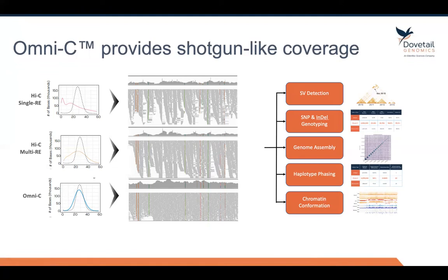What I'm showing here is sequence coverage plots. The x-axis represents the depth of sequencing and the y-axis represents the number of bases represented at that particular level of coverage. The ideal plot you should get is shown with the dotted line — this would represent what you'd typically get from a shotgun library, meaning very even coverage of the entire genome. The problem with single-enzyme Hi-C is that because you're using a restriction enzyme, you get bias, so you get some of the genome that's not represented at all, as shown on the left.